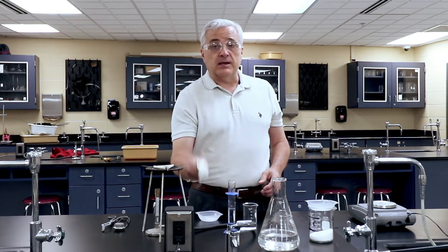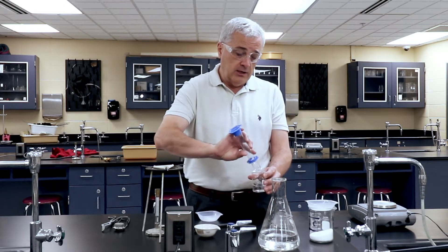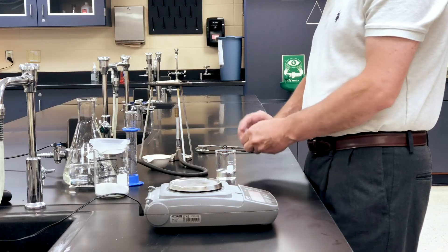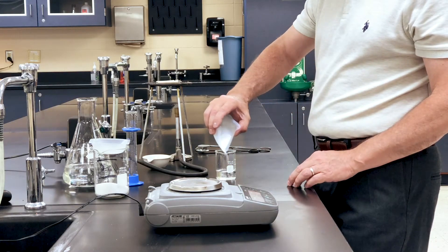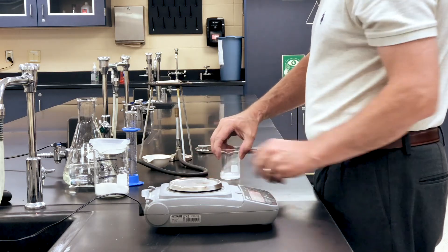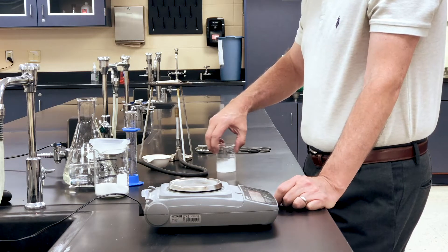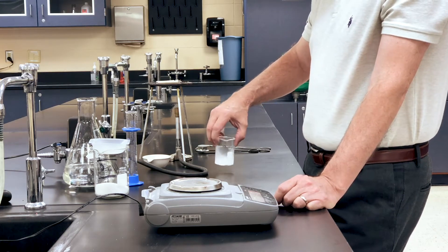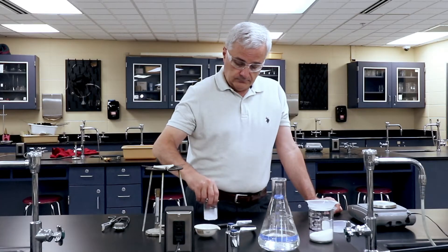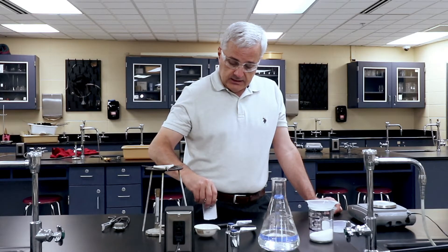I'm not going to try to mix in the dish. I'm going to mix in a beaker. So I'm going to put the water in the beaker, add the salt to the beaker, and then agitate it — just swirl it until it all dissolves, creating a very high concentration of sodium chloride in the water.